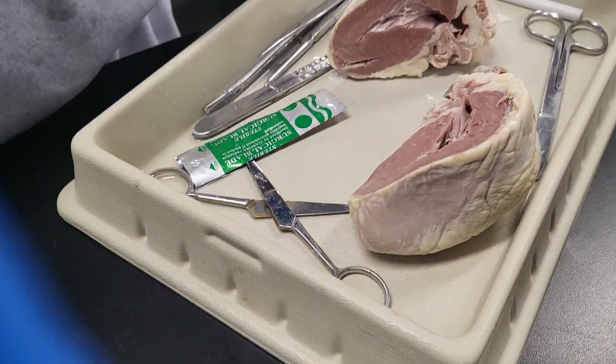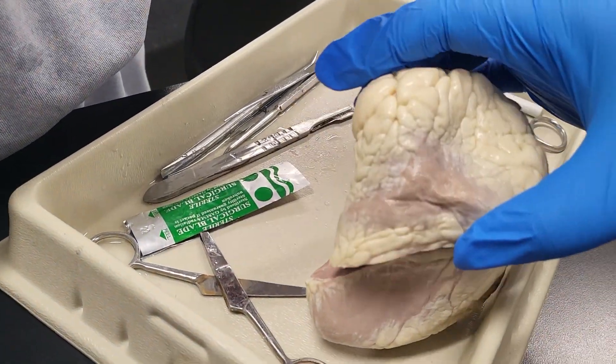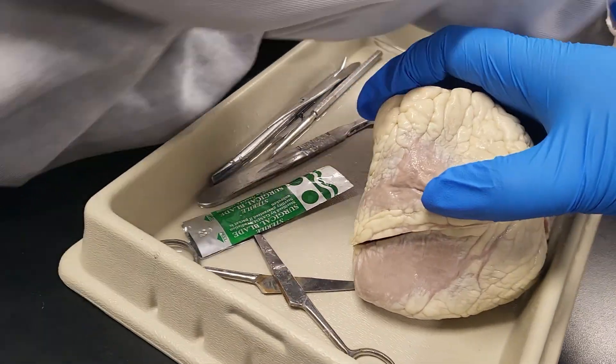Here I wanted to show y'all a good cross-section. And now I'm going to connect both sides of the heart so y'all can see the full heart.